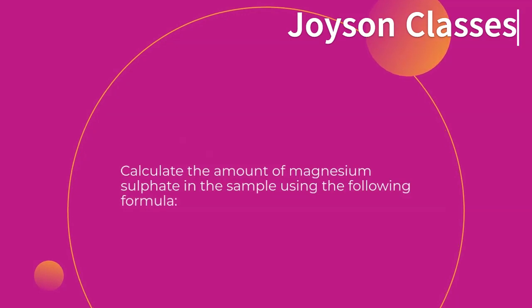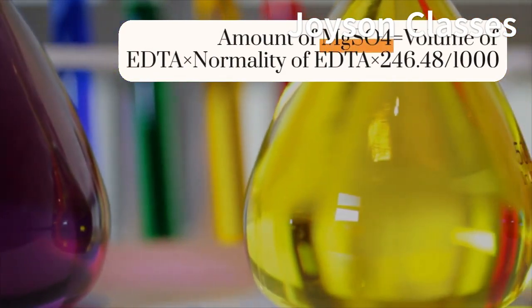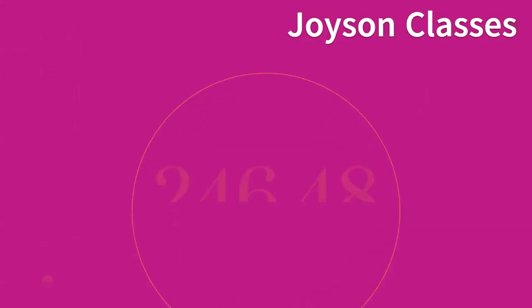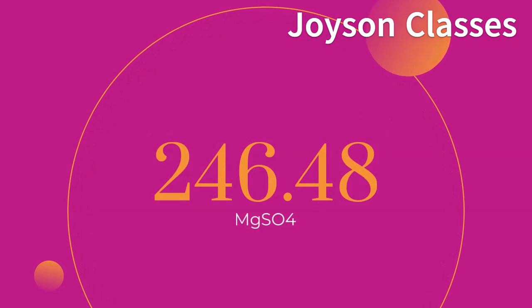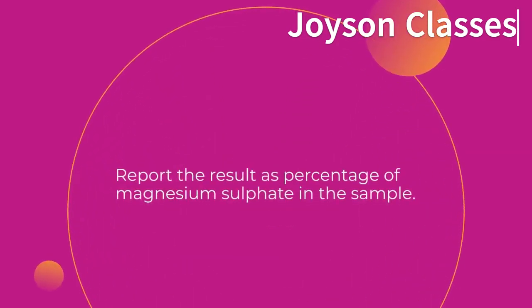Calculate the amount of magnesium sulfate in the sample using the following formula. Amount of MgSO4 equals volume of EDTA times normality of EDTA times 246.48/1000. Report the result as percentage of magnesium sulfate in the sample.